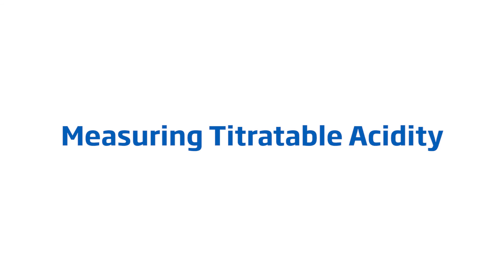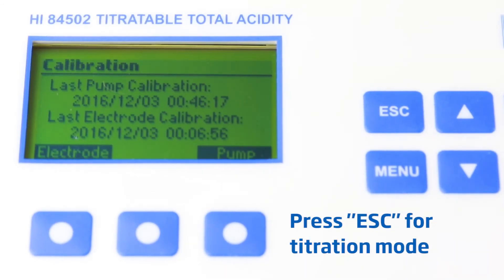Now that we've calibrated, we can perform tests. Here's how to perform titratable acidity.